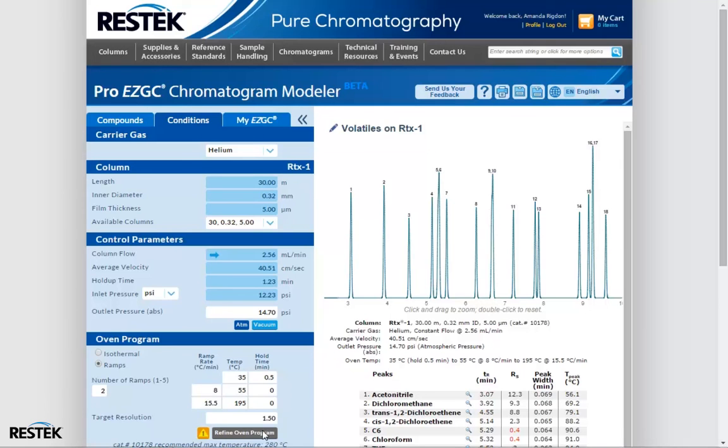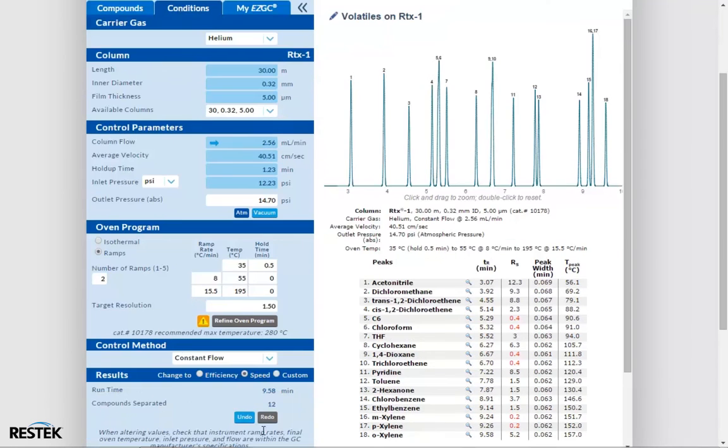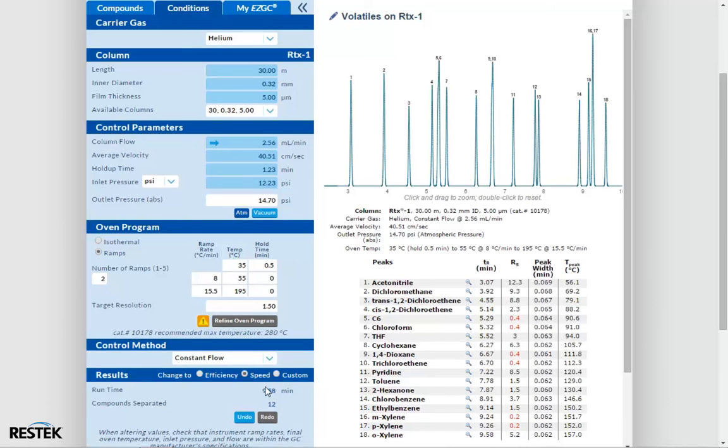Let's take a look at some of the other parameters. Let's start from the bottom. At the bottom of the parameters window we have three radio buttons that allow us to set our carrier flow to optimize for efficiency or speed or to open up all the parameters and enter a custom program. The modeler defaults to speed optimized flow and we can see that our flow is set to 2.56 mls per minute.